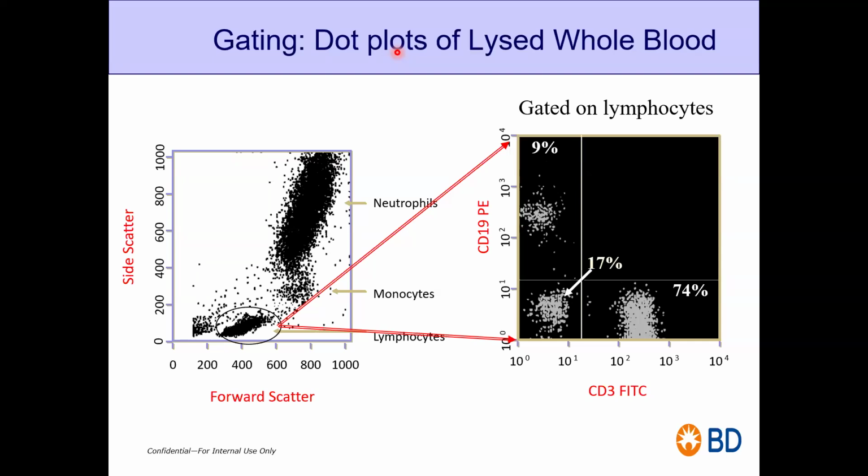Right now, I saw one question Kiran has asked: what type of cells or particles might correspond to the cluster with small FSC and SSC pulse? If I'm getting it right, Kiran, I'm using the relative word, a relatively small cell. I'm taking the example of lymphocytes because that is a heterogeneous population.